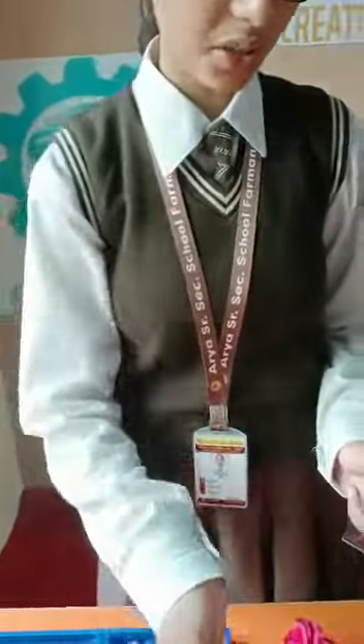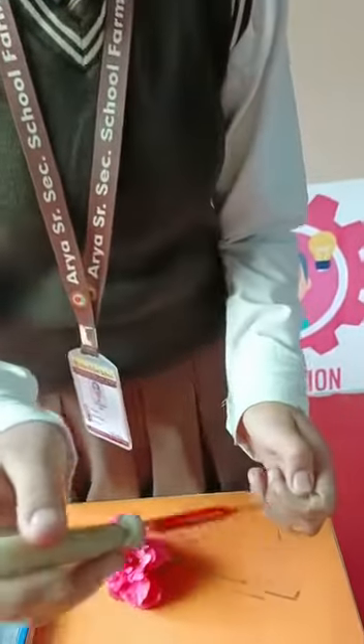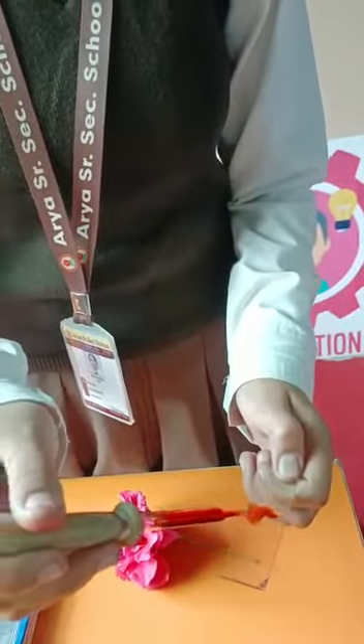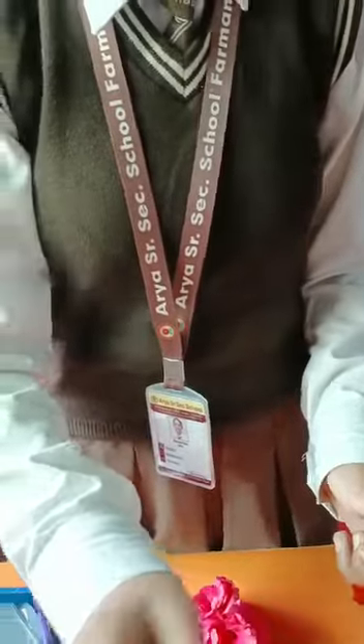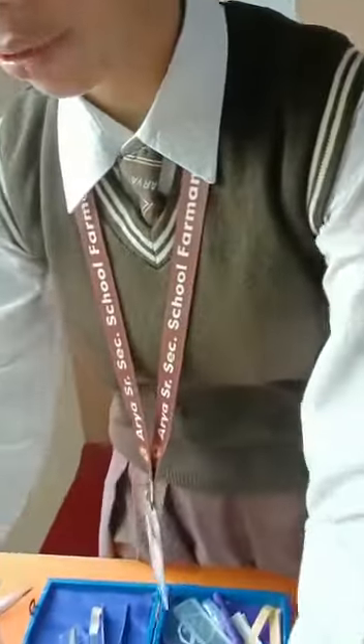Now add few drops of stain solution. It will give color to the cells. Leave it for 2 minutes and then remove the excess stain.